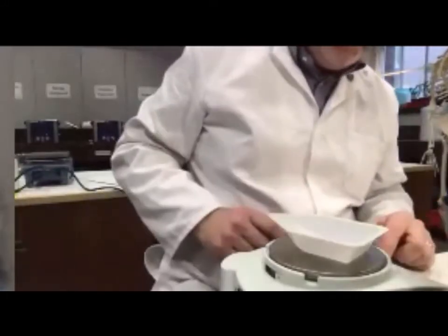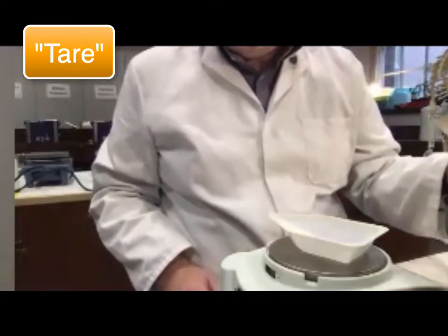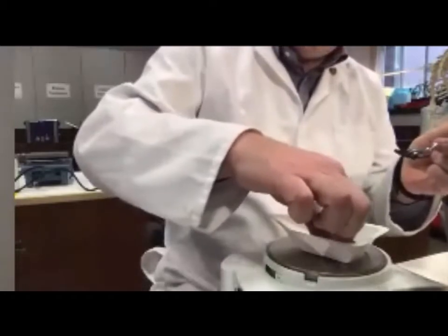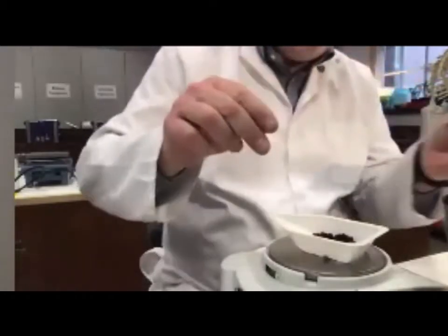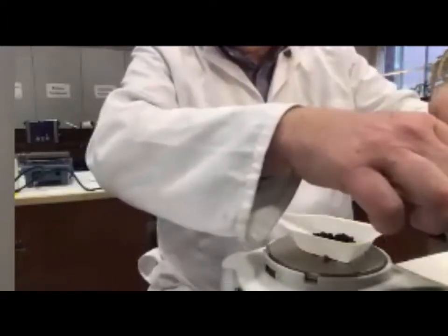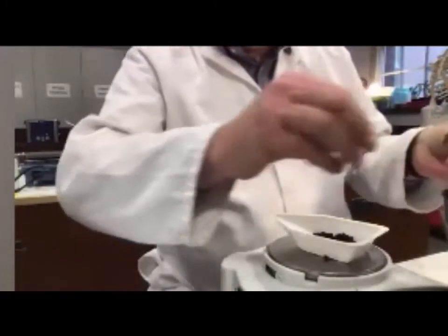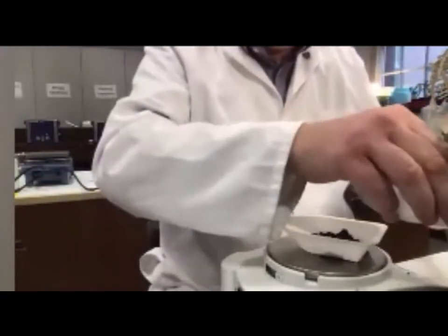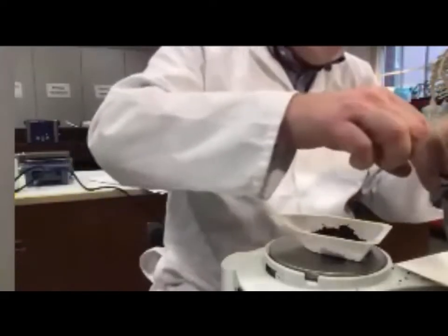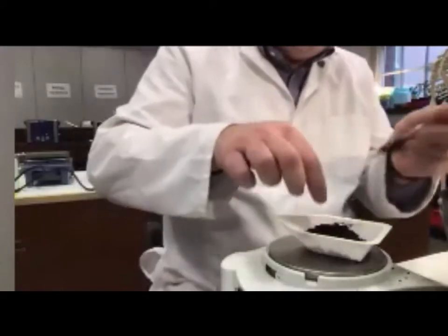Weigh out 50 grams, so tare that. If you hear me saying tare that, it's T-A-R-E. Pick out the little stones. We don't want that. I can top up the plant, by the way, another time. This is actually the topsoil from here. When I say here, I mean the campus.